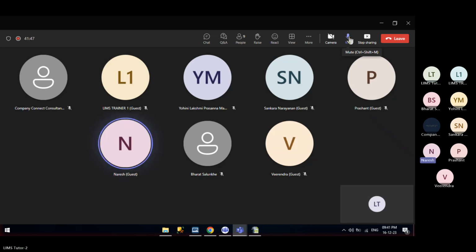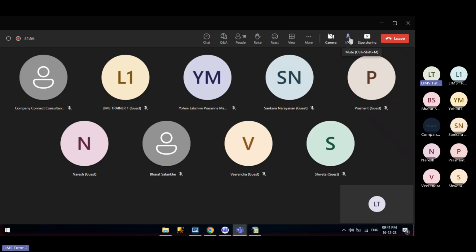There is no direct integration. Other LIMS also have that. This is my fourth product that I have worked on, and in all the cases we are facing this challenge to integrate with the CDS system, whether it is Chromeleon or Empower. The challenge is the same.